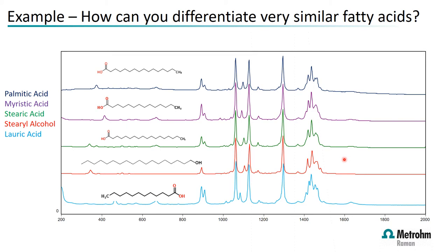We've developed a technique which looks at very subtle changes in the spectra and allows us to provide what we classify as a verification on the sample. So here we're looking at minor differences in the bands, both at this region here, around 900 wave numbers, and also subtle differences in the peak shapes and sizes of these bands, just short of 1500 wave numbers.